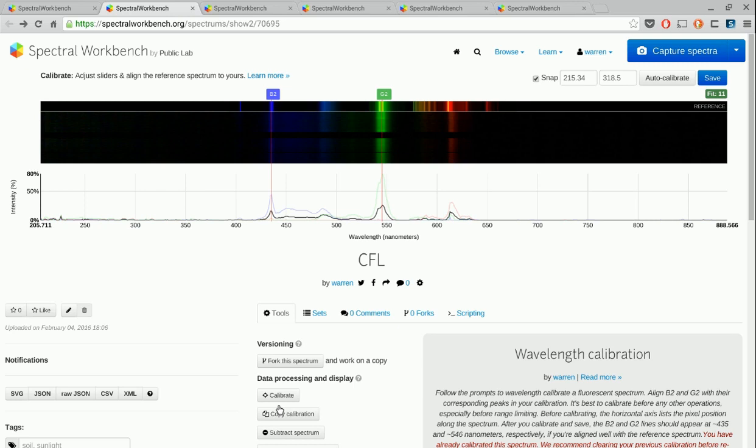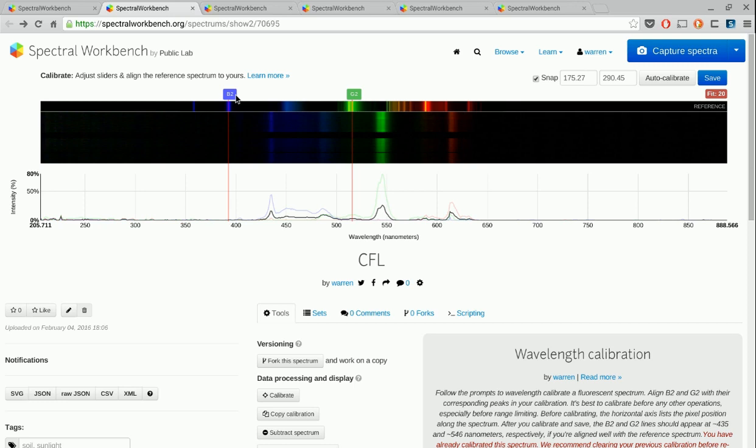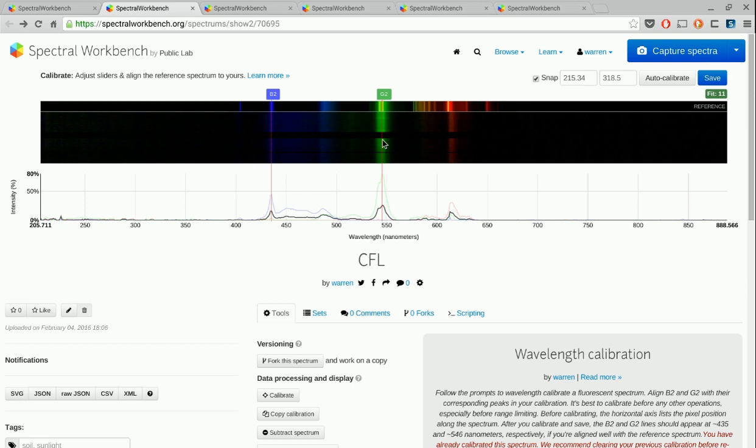When you click this calibrate button, you get this interface that just popped up. And what it does is it shows you this reference spectrum. You can see it's marked as the reference spectrum here. And we've calibrated that one really well. And what you have to do is grab these markers and drag it around, line it up. What you might have noticed is when I had just clicked it, they were already really well lined up. That's because we run an auto calibrate when you start the calibration sequence.